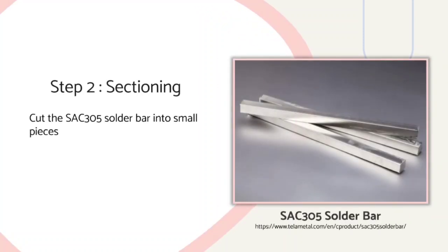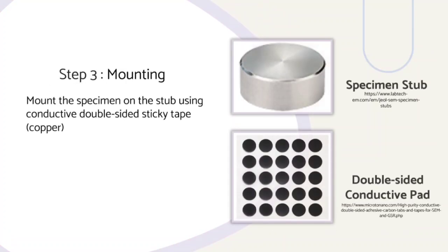Step 2: Sectioning. Cut the SAC-305 solder bar into small pieces. Step 3: Mounting. Mount the specimen on the stub using conductive double-sided sticky tape.